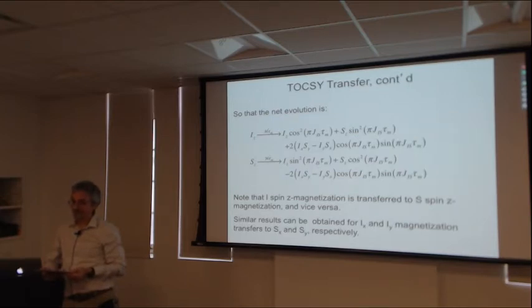The ROESY rate has opposite sign as the NOESY, and in the limit of a large molecule, that ratio is known to be -2. And that means it's possible to arrange the mixing sequence so that you average the NOE cross-relaxation against the ROE cross-relaxation and can get them to balance. So these are called clean TOCSY sequences.